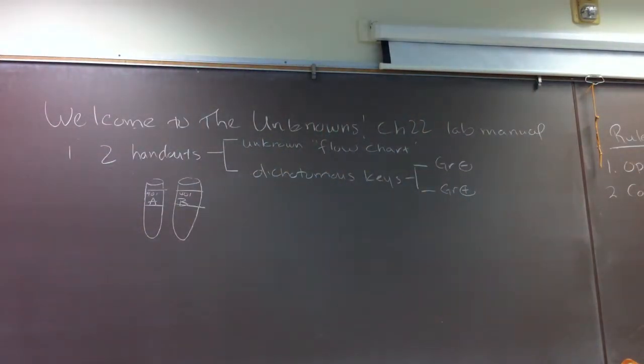And what you could start to do is on your plates, you can start labeling them. You could put your name, the date, the lab section, and you can draw your 4 quadrants. Because today you're going to be streaking your plates using aseptic technique to get isolated colonies.